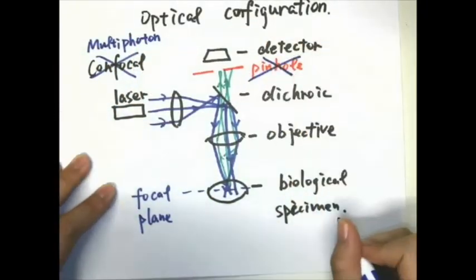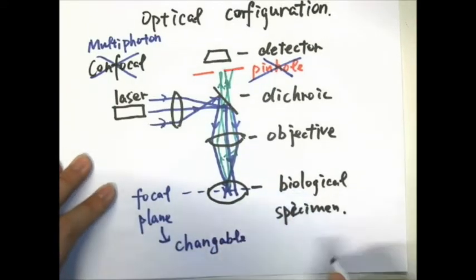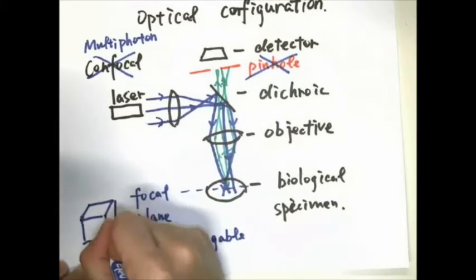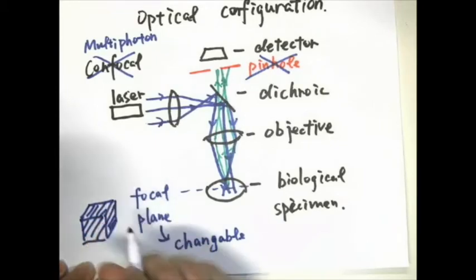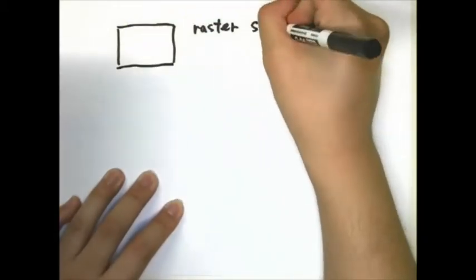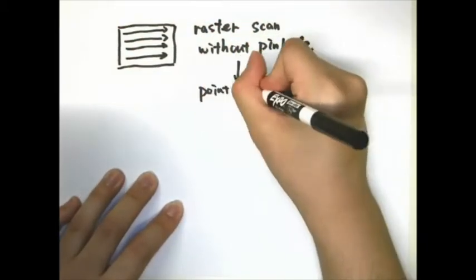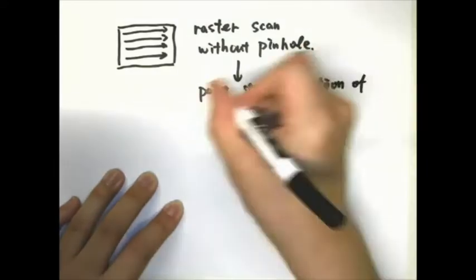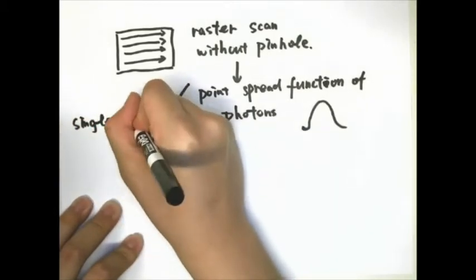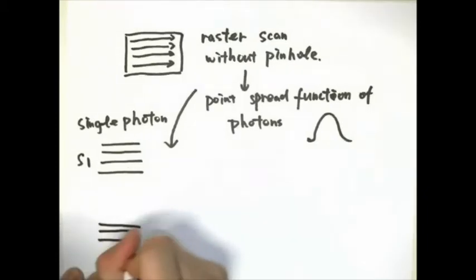Whereas in multiphoton microscopy, a pinhole is not needed because only fluorophores on the focal plane where there is enough number of photons emit fluorescence light, meaning no out-of-focus light to block. Both multiphoton microscopy and confocal microscopy can image at different depths to create 3D volumetric data. But multiphoton microscopy usually has better quality of 3D volumetric data due to its absence of out-of-focus light. Multiphoton microscopy reads out data line by line in a raster scanning mode. The optical sectioning produced by multiphoton microscopes is a result of the point spread function.